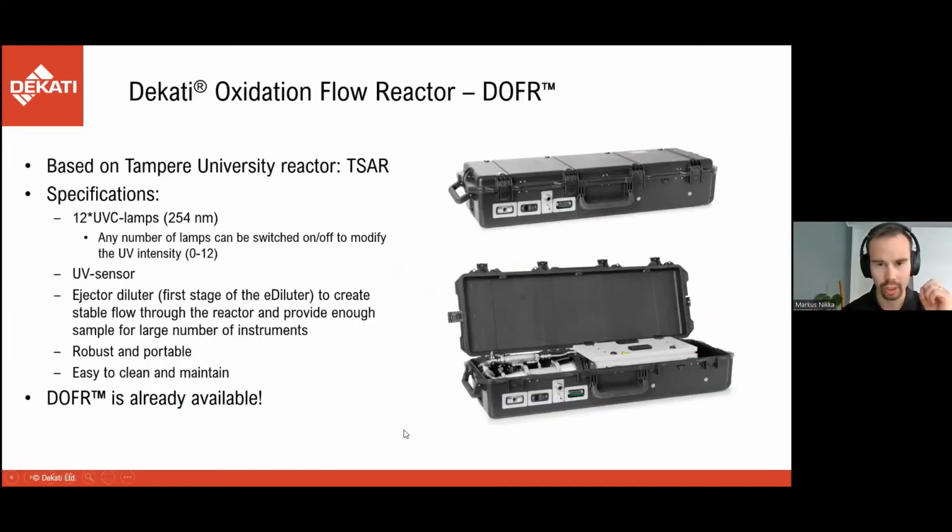Okay, so the Dekati oxidation flow reactor, the DOFR, is based on the Tampere University reactor, so the one we saw a picture of a few slides ago.